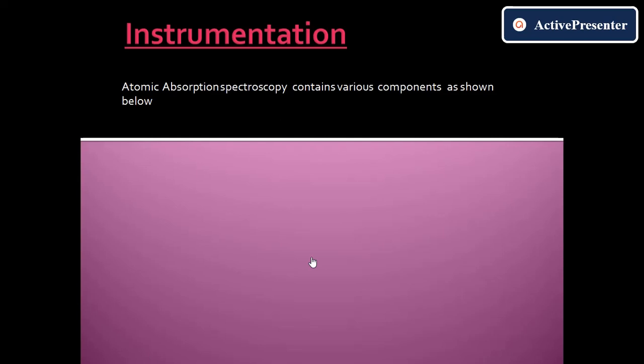This is the first case, and you can think of it as atomic absorption spectroscopy. In a similar way, when an atom is excited to a higher state but, being unstable, regains its mean position, there is an emission, or a radiation due to the unexcited atoms, and these radiations are sent to the prism and then to the detector.